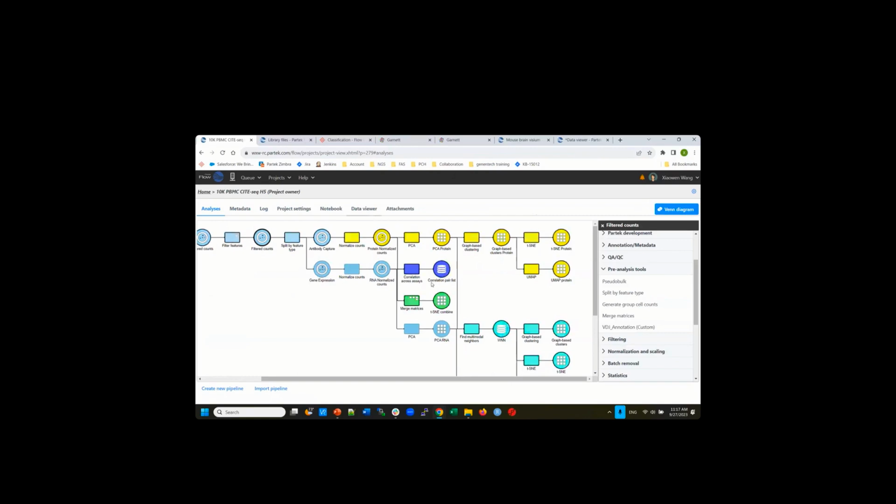And also we have the normalization function. Usually you want to normalize them differently. For protein, in this field, people use CLR to normalize, but for gene expression, you use a different one. So you can use the same normalization or you can use a different normalization.